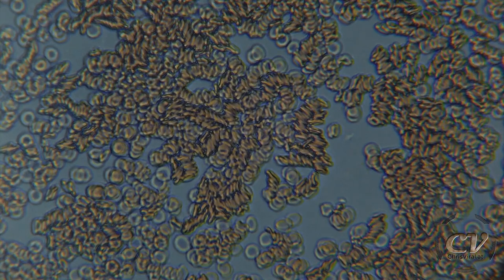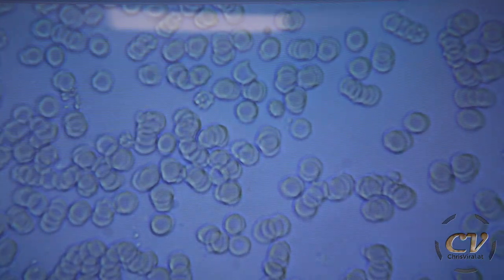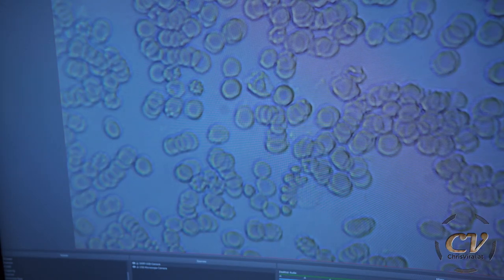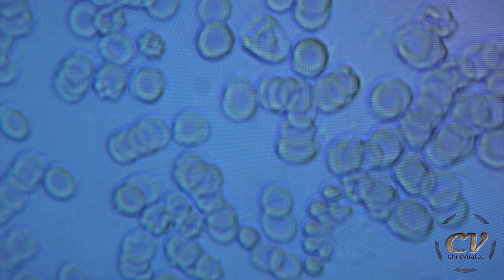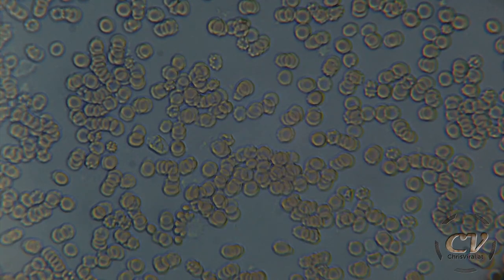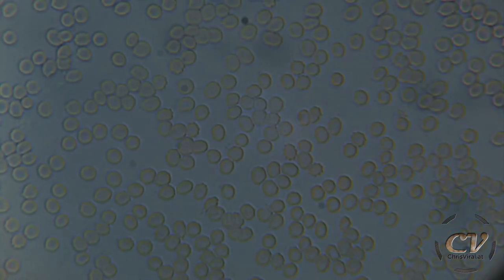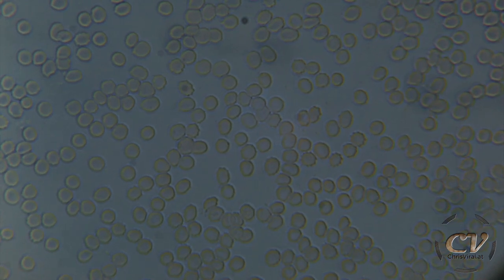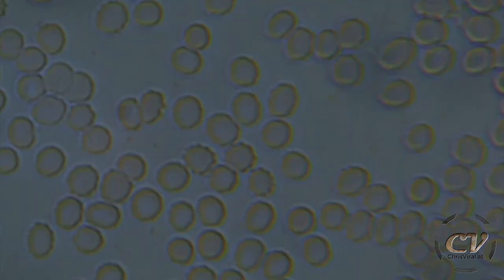They're going to sleep — they're totally going to sleep. There is another one of these funny ones, and that's another prime example right there. There are three actually — oh my god, there are so many on this one. It's like half an hour later and it's still moving. Clearly a bit out of focus, but you can see the edges, like the spikes, so good. That's crazy.